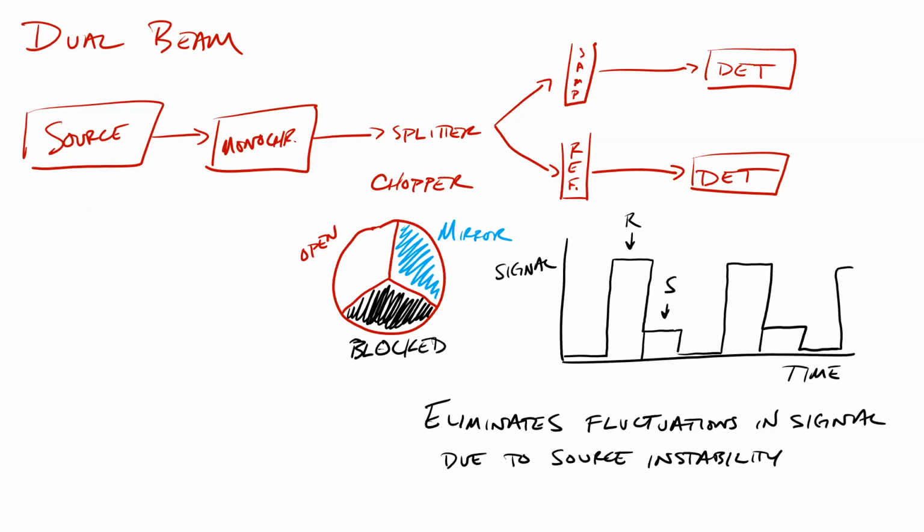What exactly are we measuring in the UV-Vis? Absorbance. So absorbance is what we get out, but is that what the detector is actually measuring? Transmittance? Yeah, it's measuring the power transmitted. And so our blank solution, the solution without any analyte, should transmit a whole lot of power through it, right? That's why our reference is so high and our signal is so low, right? So again, the reference has a large signal because it's the power that goes through it that we're actually measuring.